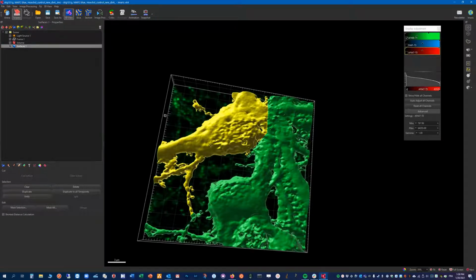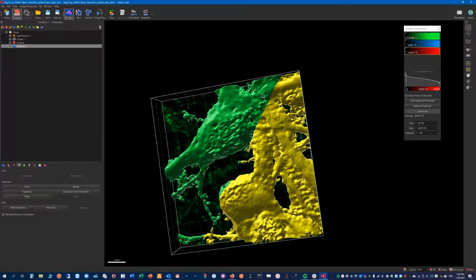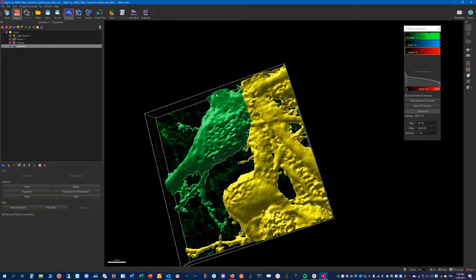So how do we deal with those many parts now? Well, we can just bring them back together by using Control and click here, and then select everything we want to bring back together and click here to unify. So now we have one object here and another one here. We still see the cut lines here, but this doesn't matter that much.